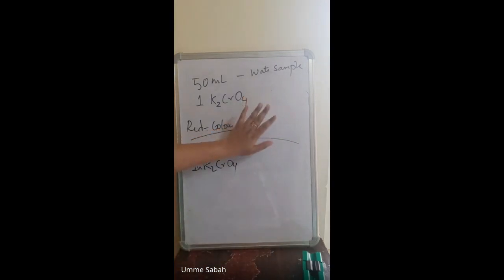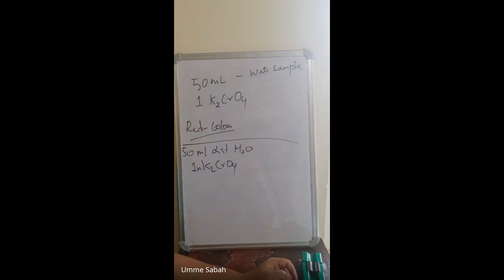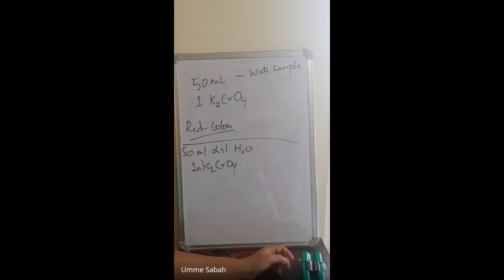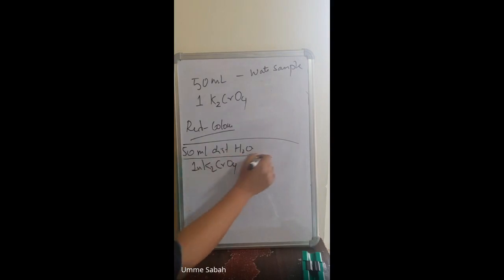So these are the titrations you are doing. Now coming to observation and calculations. Like how we weighed the weighing bottle yesterday, you have to weigh the weighing bottle first. That will be your M1. Against silver nitrate only, you are titrating distilled water, adding K2CrO4, and against silver nitrate only you are titrating.